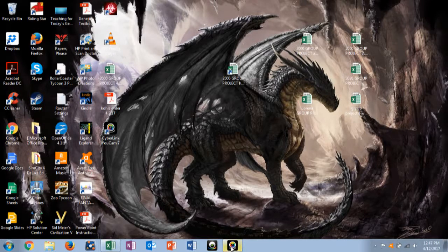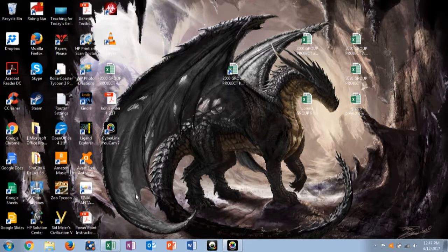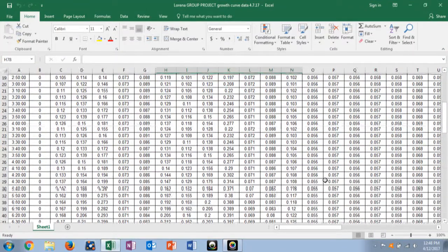Okay, so this is your grad TA Charlie, and I'm using a desktop capture video for the first time in my life, and I'm going to try to explain to you guys how to deal with your growth curves, because I'm getting a lot of questions about them, and I realize it's a lot of data and probably pretty intimidating when you're looking at these Excel things and all you see is giant lists of numbers, and honestly they're pretty terrible. Looking at this, like, what is this? I don't even want to look at this.